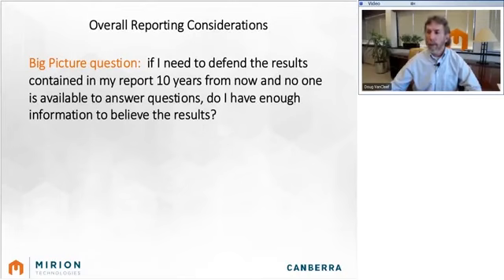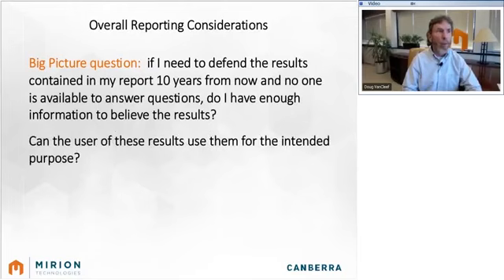Here's my opinion about this. The big picture question should be, if I need to defend these results contained in my report 10 years from now, and no one is around to answer questions, do I have enough information in the report itself to believe the results? Another important question is, can a user of these results use them for the intended purpose?